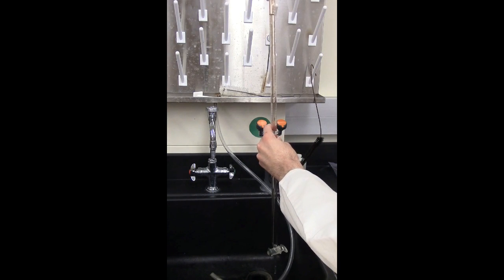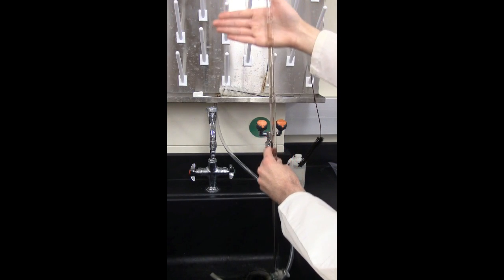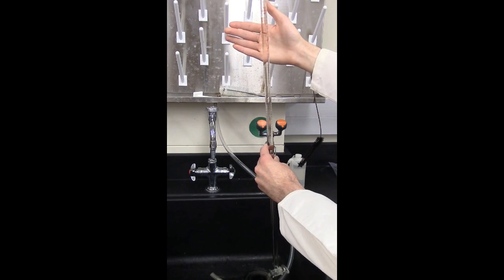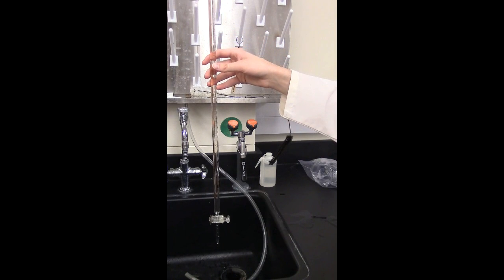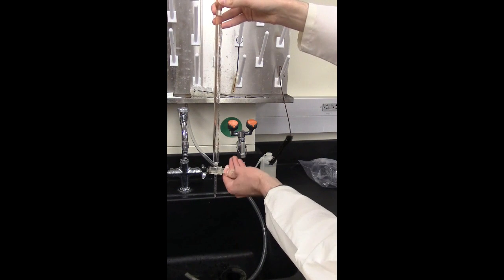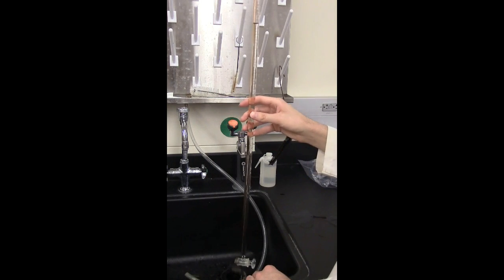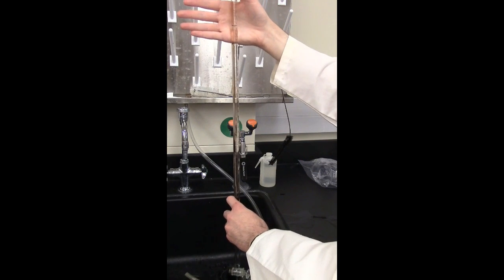Important thing to note here, you don't have to fill it up all the way to the top. In fact, make sure you don't fill it up past the markings up at the top. Otherwise, you won't be able to record the starting volume in the buret. One final note. Before you finish filling up the buret, make sure some of the liquid gets into the tip of the buret. So just pour a little bit out. You need to do this, otherwise your initial volume that you measure at the top of the buret will not be accurate for when you do your titration.